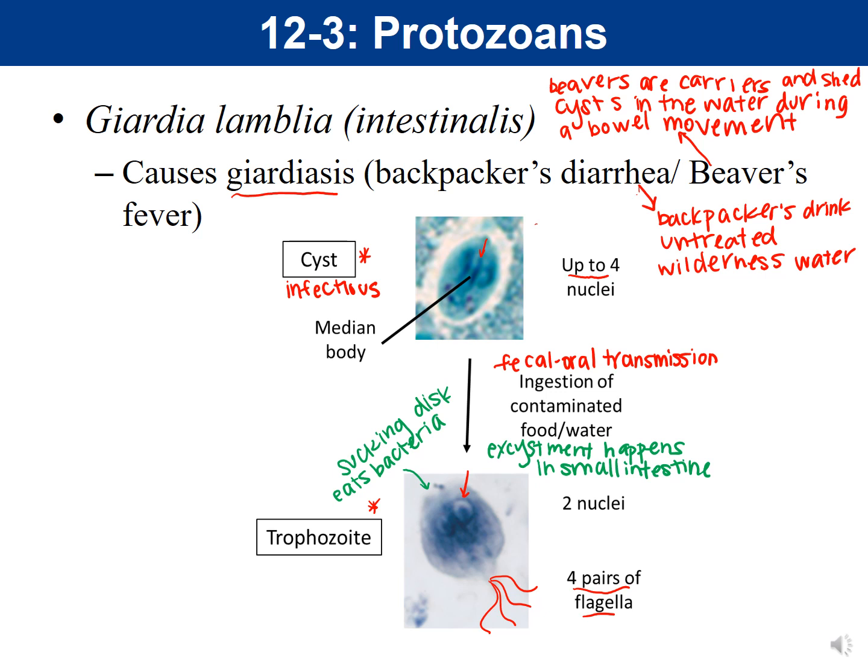Now, one of the differences between Giardia and the other two, so Entamoeba and Balantidium, is that this one does not penetrate the intestine.